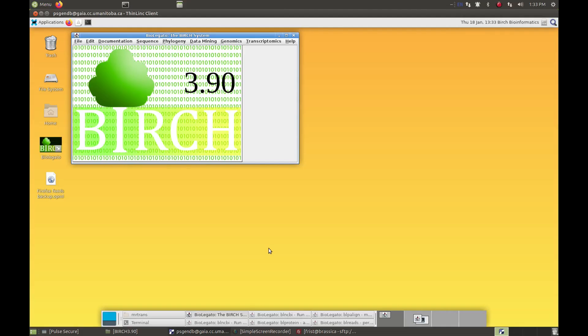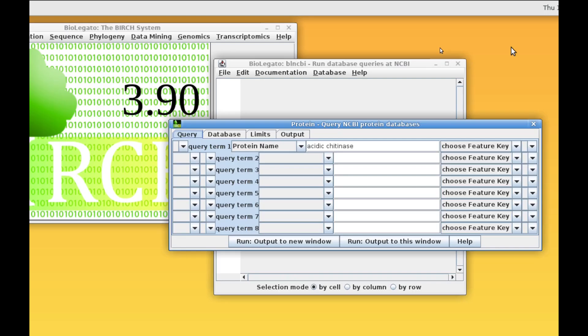For those new to Birch, Birch is a platform consisting of hundreds of bioinformatics tools unified through the BioLegato graphic user interface. Because BioLegato is programmable, it's easy to create new graphic interfaces for each different type of data.